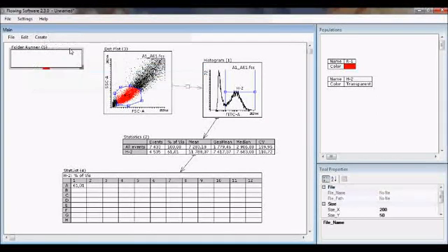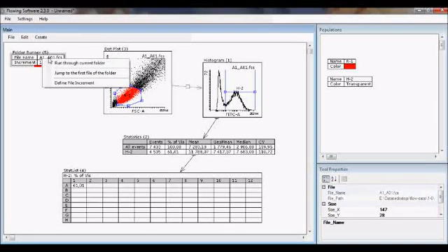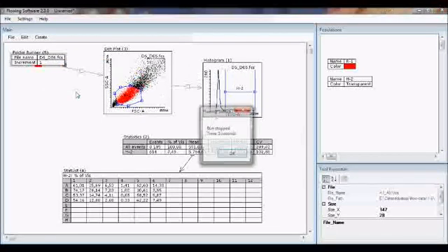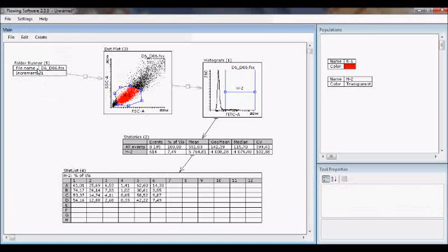Folder runner is very easy to use. You just load the first one and connect it to here, and then we can find feature run through current folder. Now when I start running, it goes through all the files in the folder and updates this, which updates this, which updates this, which updates this, and this happens until it reaches the end of the folder, and data is here.